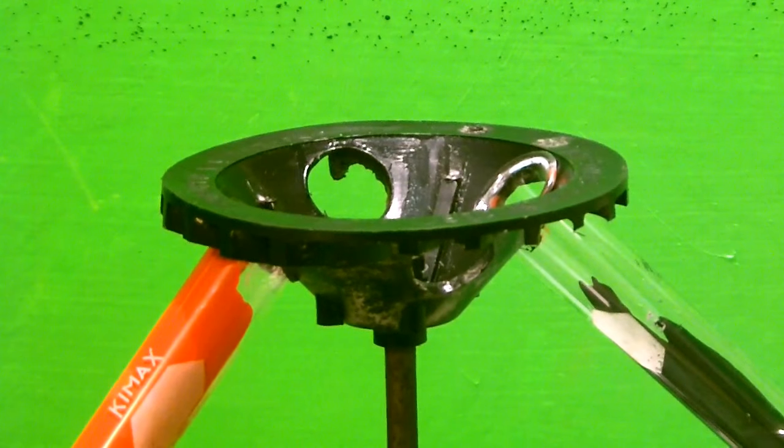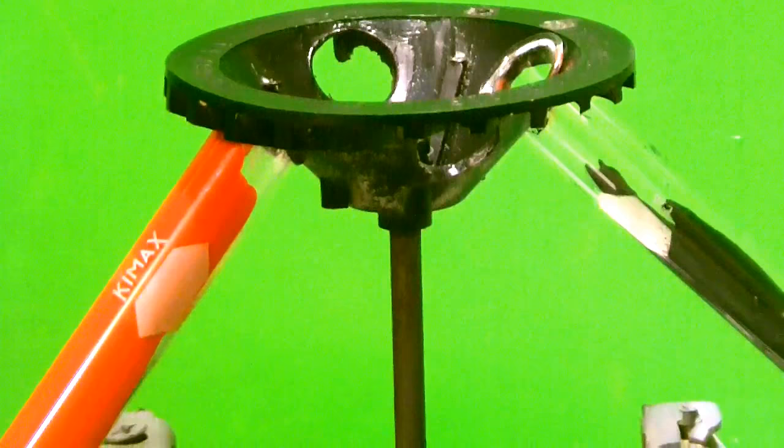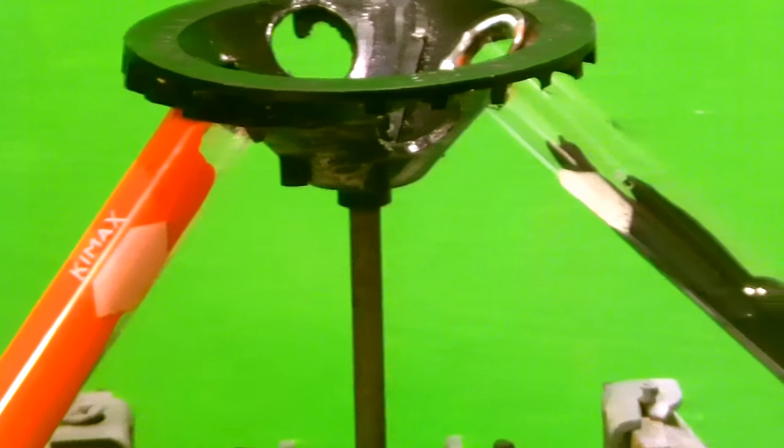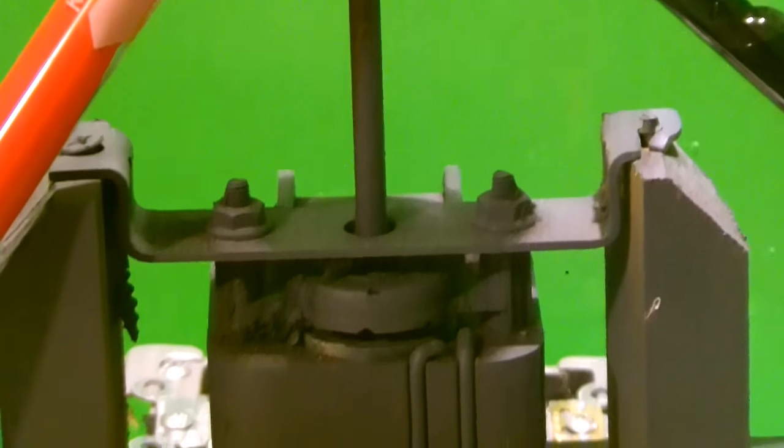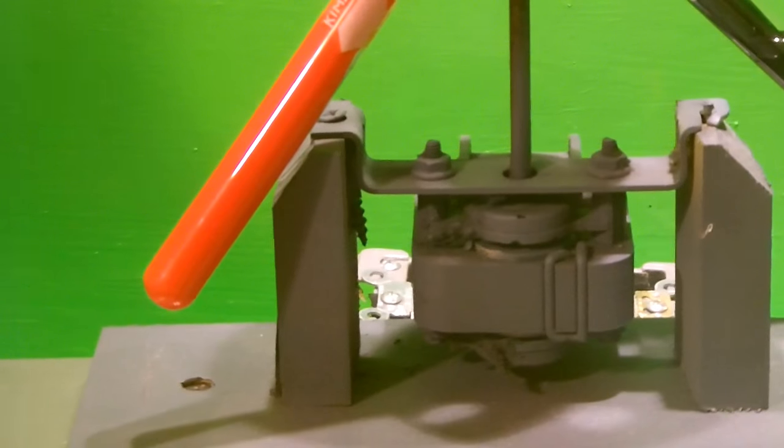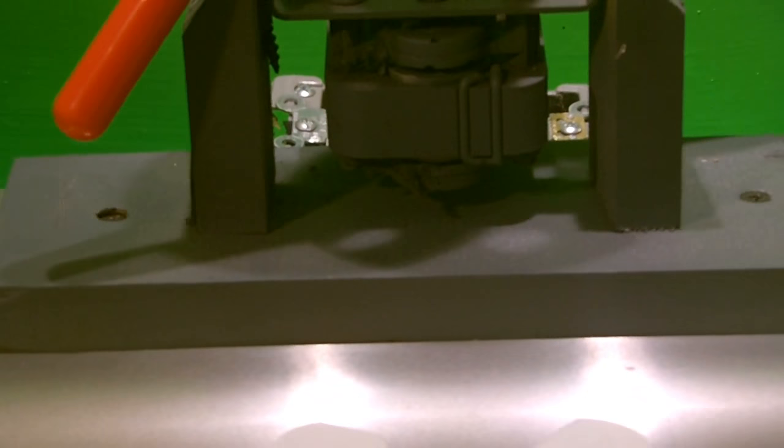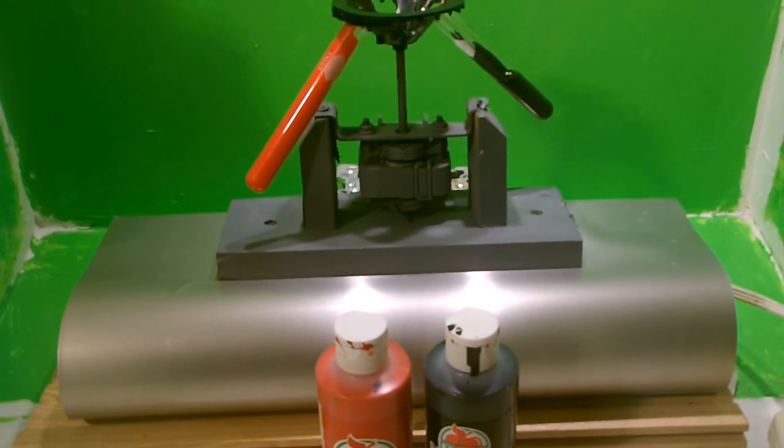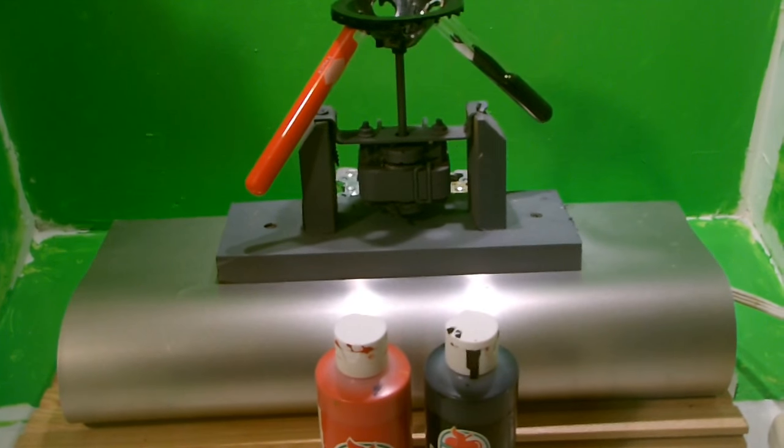What you could see is I drilled some holes on the fan. I cut the fan's blades right off. I kept the motor and I screwed it onto little pieces of wood and I fastened it onto a piece of wood there. And then I fastened that onto a heavier block and I covered it with aluminum.